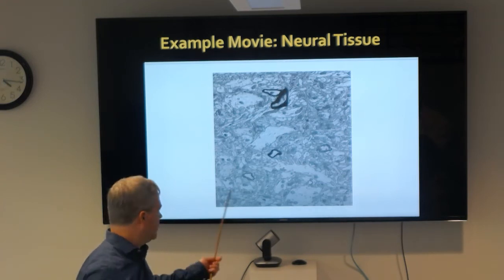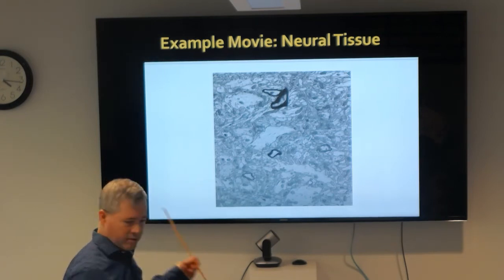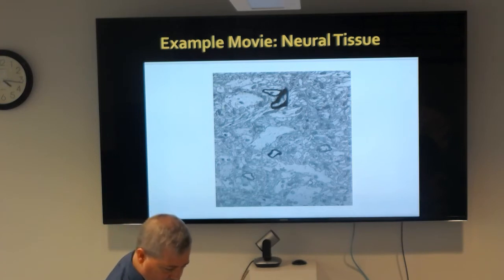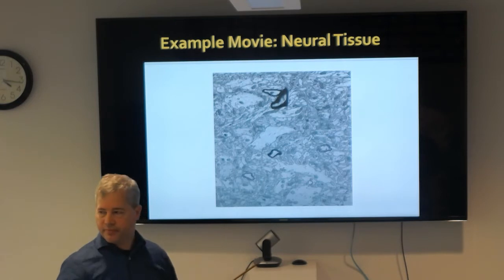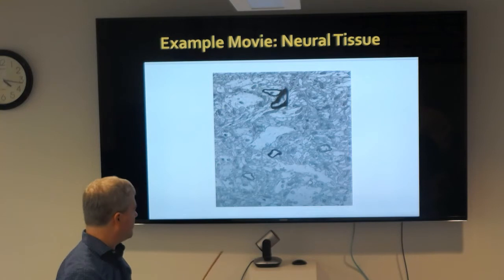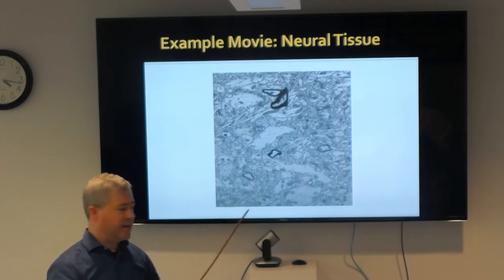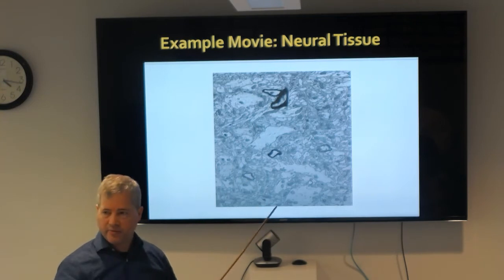If you're looking at mitochondrial organization or nuclear organization, depending on what you're looking at, that works. What you're not going to be able to do is atomic type things. However, we do have some people who have used antibodies which are labeled with gold or something like that, and then bound the antibody to their sample, and then they can see where the gold particles are, and detect that sort of level of resolution.